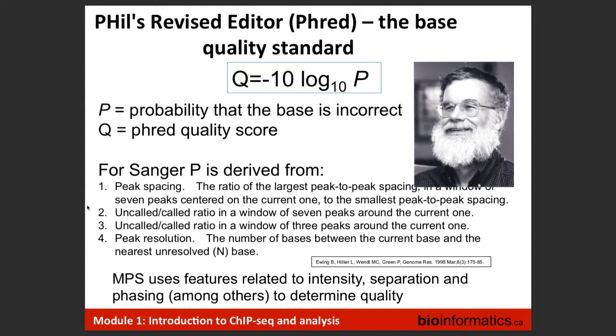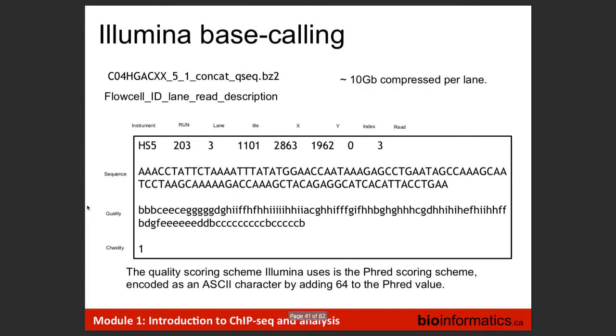The concept of the PHRED score was developed, and again, it's a log transformation of probabilities, and the probabilities are empirically determined from the data. So the initial Solexa or NGS platform sequencing data qualities were based entirely on misalignments to the reference genome, but as we did more sequencing, we developed a probability score, and then that's encoded in the file.